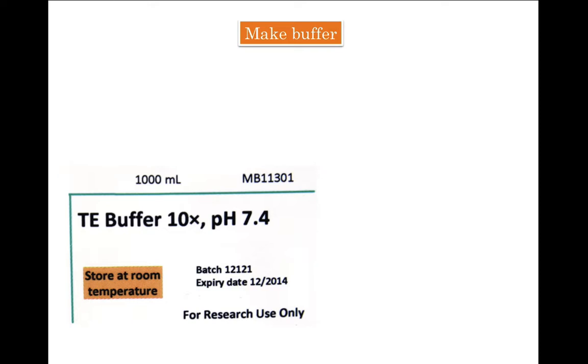Because Tris is used as a component for many reagents commonly used in molecular biology and biochemistry. For example, as part of TAE buffer for gel electrophoresis, as part of buffer used in western blotting, and as part of buffers used to prepare membrane fractions. This is why labs prepare and stock up large amounts of Tris solution, usually 1 molar concentration. And that is what we are going to use and simply dilute it to make TE solution.